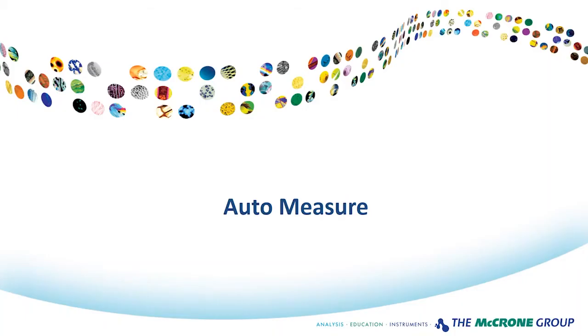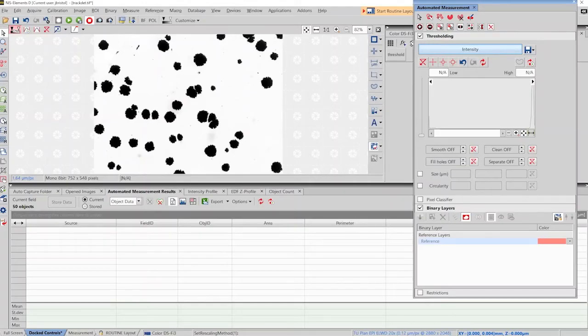Auto measurement measures the number or area of objects which are extracted from the image by the creation of a binary layer through thresholding. The results can be listed or exported as text or in an Excel file. It is possible to save and reuse thresholding parameters. Auto measurement, also known as object counting.